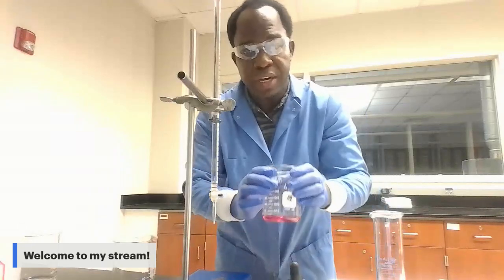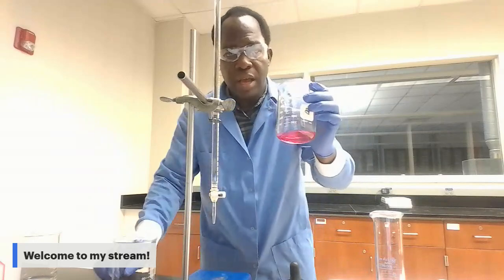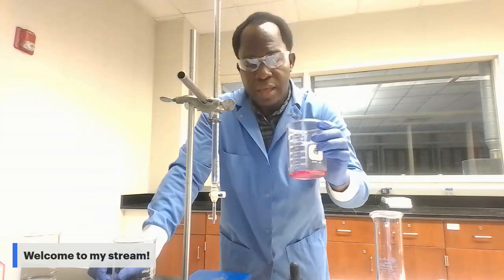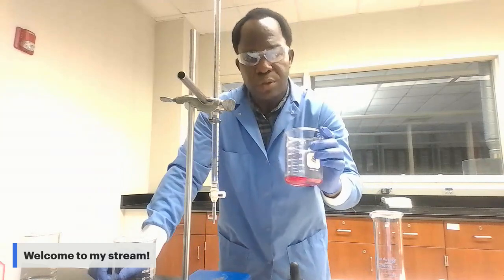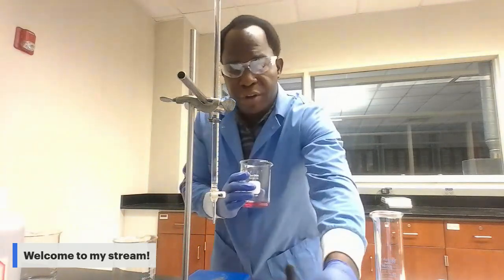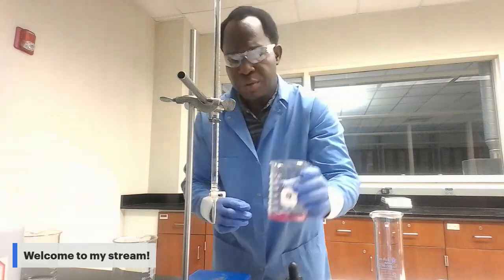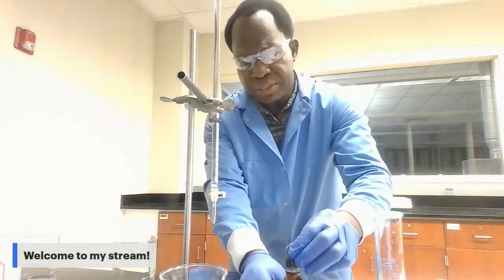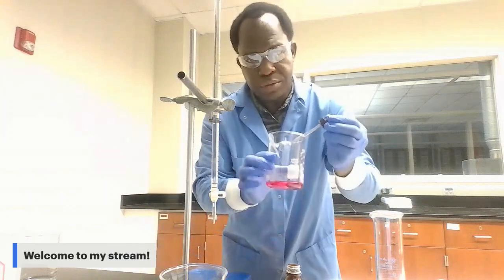What is the reason? Phenolphthalein gives you a pink color in a basic solution. When you add phenolphthalein to a base, that's what you get. I'm going to do the same thing for the other two.